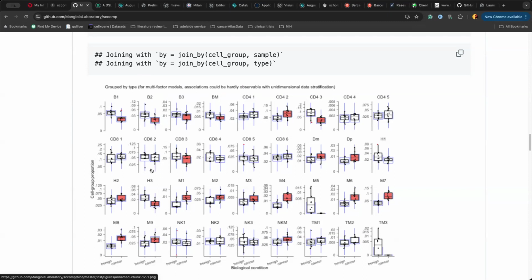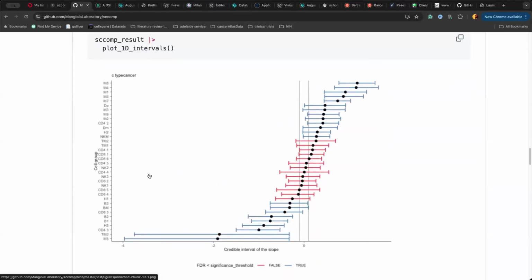So this is a check that the model is interpreting the data well. Sometimes you have, for example, a bimodal distribution, and you can see that the model does not capture that. So it's very good to say, maybe there is a parameter I'm missing, or something more complex that the model cannot handle. This is quite a good check.